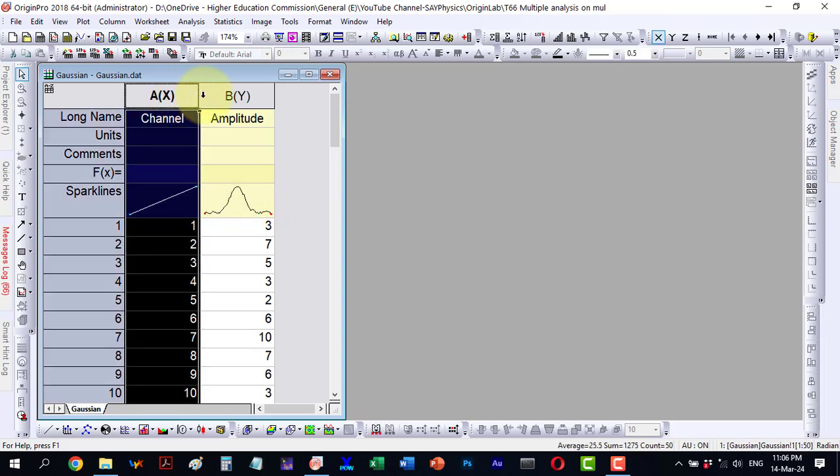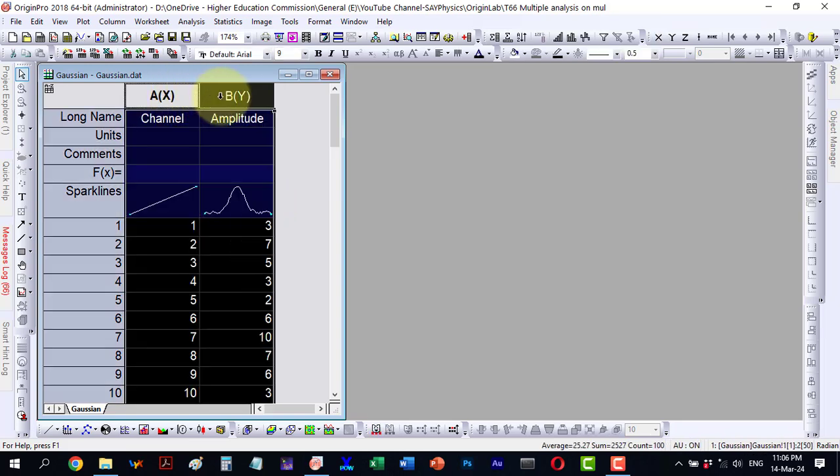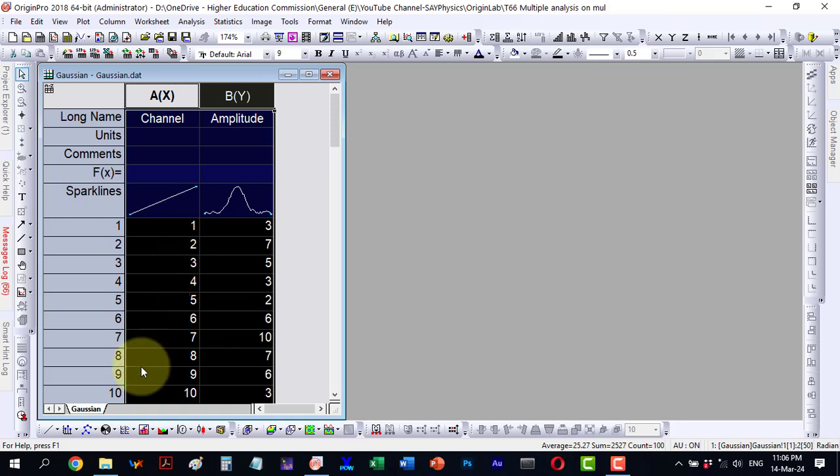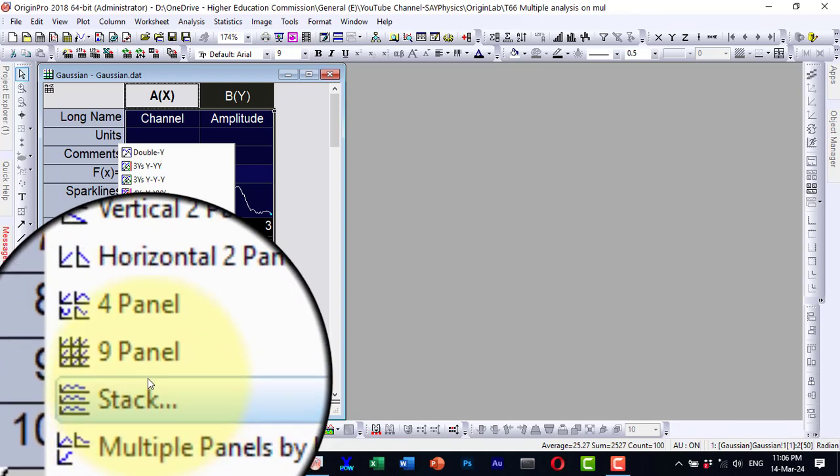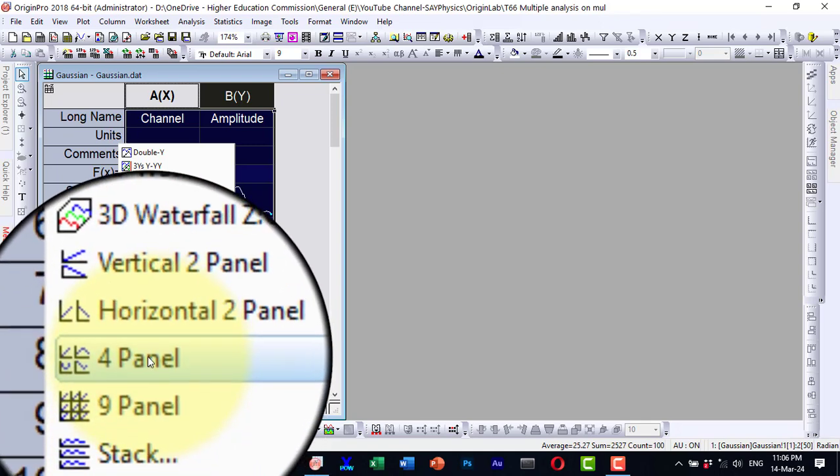For that let me select the data and navigate to the four panel plot and I will be conducting four separate analyses.